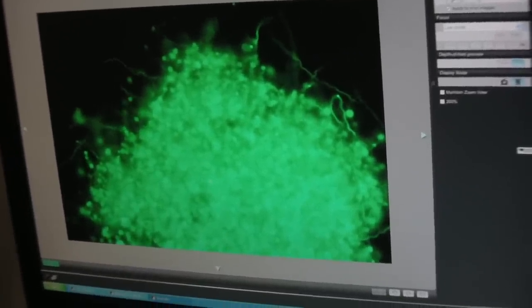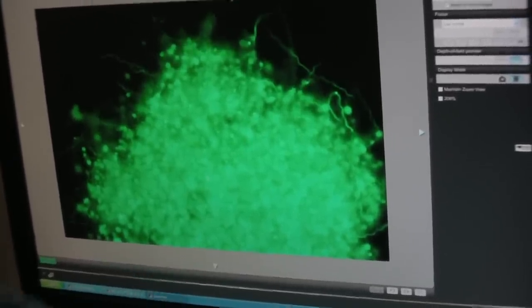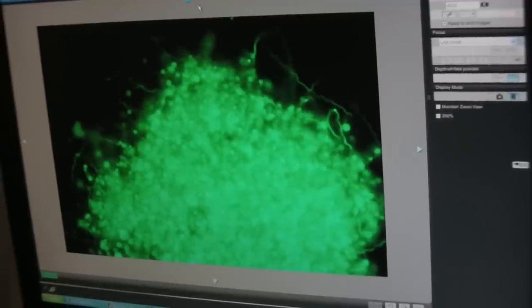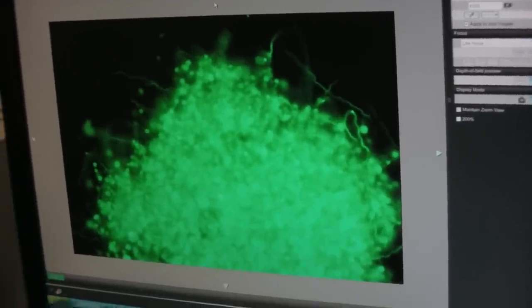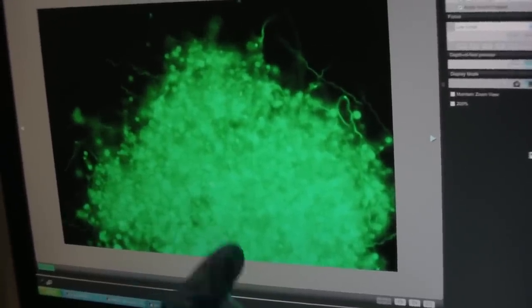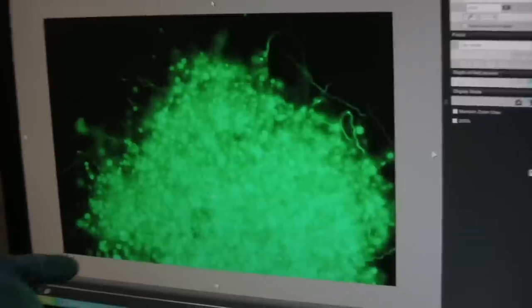How many different forms are in that mass? Well, you can readily see three, besides the existence of biofilm itself, which you could consider as another morphology, as it's not only the body itself that is in it, but it has also chosen to take residence in the biofilm, hold still, in exchange with its neighbors instead of being planktonic.